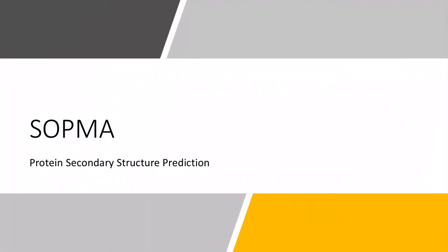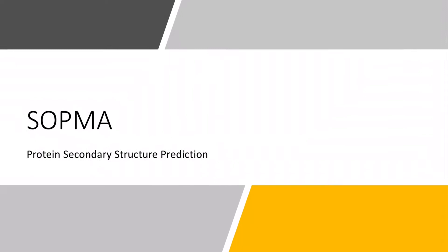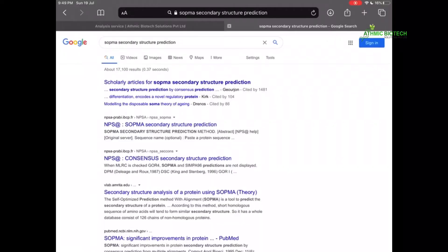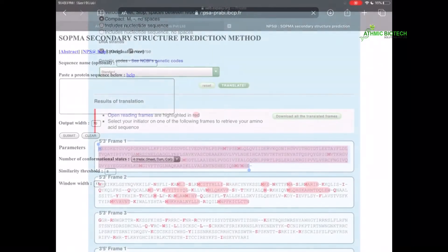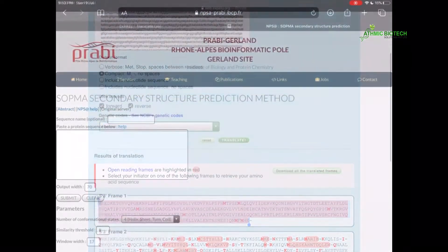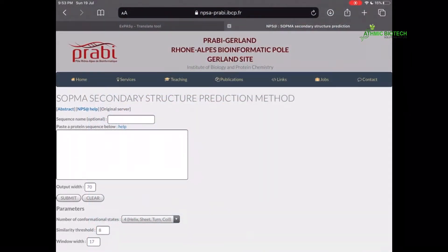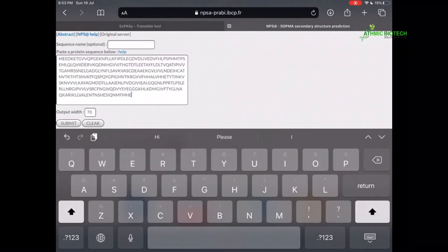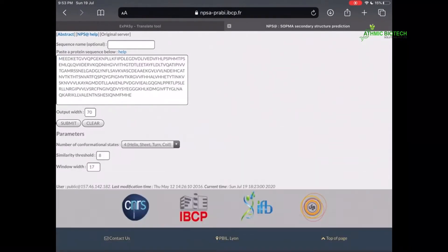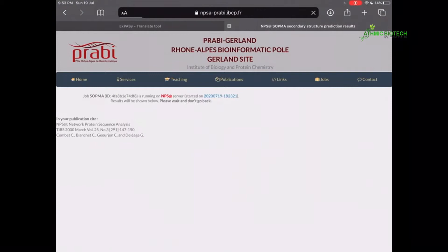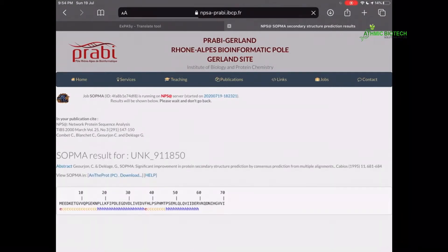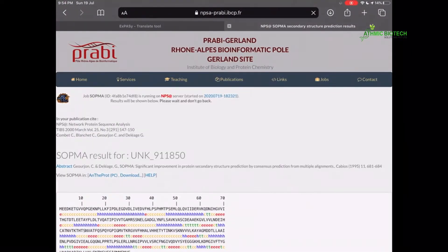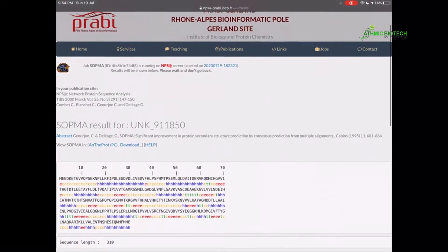SOPMA Secondary Structure Prediction Tool. Go to Google and type SOPMA Secondary Structure Prediction. You will get a home page like this. Inside that, you copy and paste the amino acid sequence, then submit. Then you will get the secondary structure.